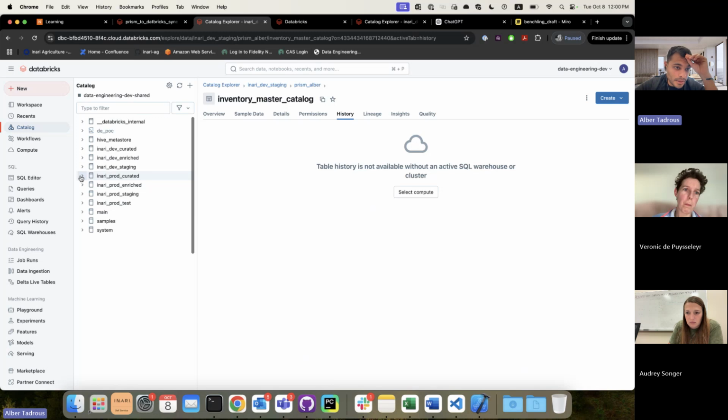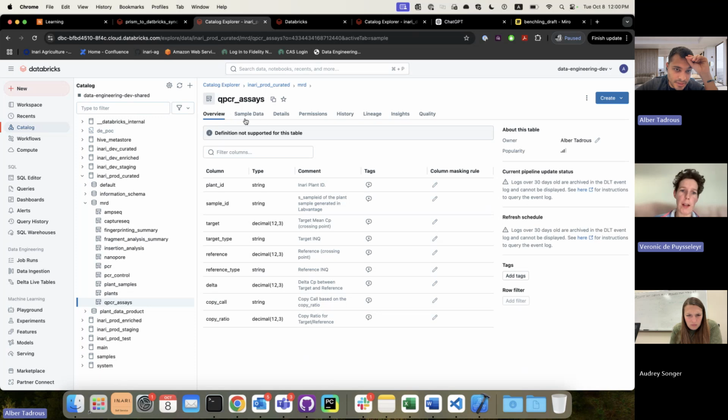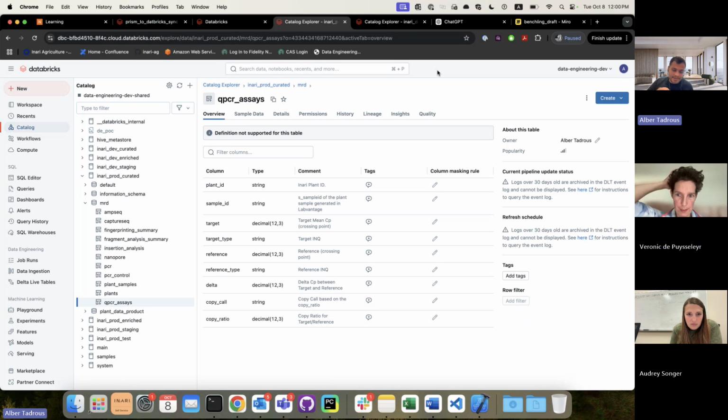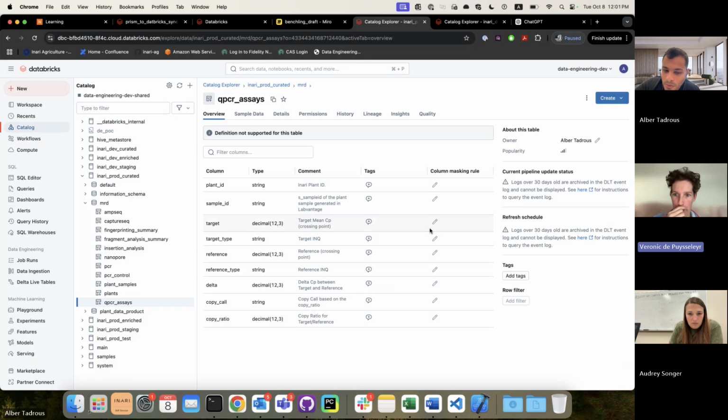So now we are talking about this qPCR table. What you did beforehand was, you had a qPCR recommendation in there. We removed it because we had a separate recommendation table for this, and they said it's not useful for them. So qPCR is similar to that.